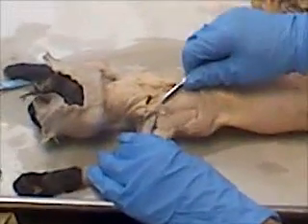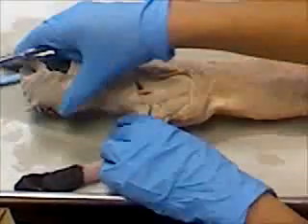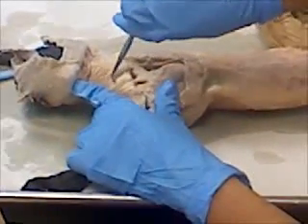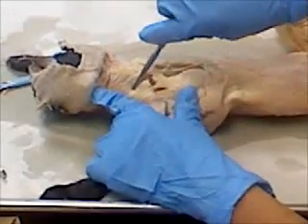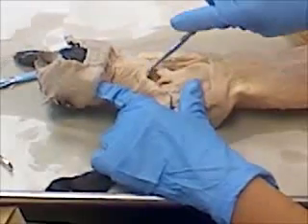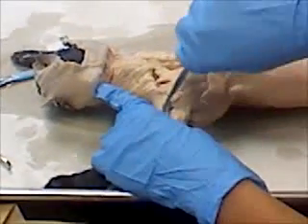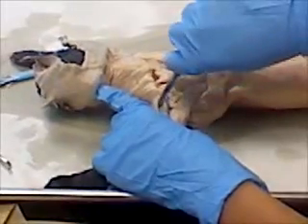Trapezius, levator scapulae and trapezius up top, over here. Clavotrapezius, because it's in the neck area, and then down here it would be clavodeltoid.